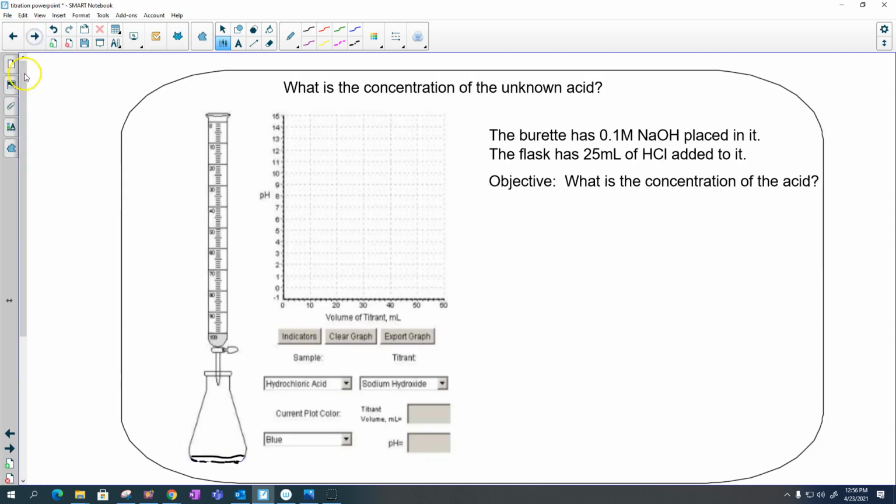Alright, so first things first, how does it work? Well, we have a large container that we'll be dealing with, called a burette. It's just a fancy tube that's got lines on it. You fill it up and you can turn a stop valve here, and it will allow you to dispense some things together. In the bottom here, we need some way to know when we reach what we've been referring to as equivalence. So in this particular reaction, we have NaOH and HCl. So NaOH plus HCl will produce NaCl plus H2O.